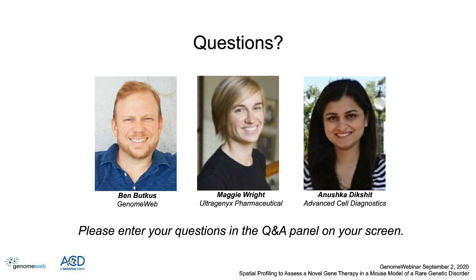The next question is also for you, Maggie. Are you able to evaluate the degree of off-target or other overall transcriptomic effects of the AAV therapy by sequencing only the portion of the mouse brain section with a positive signal? I'll say that we haven't done that yet. That's something that we could definitely look into in the future, but it's not something that we've been looking at in these first studies.